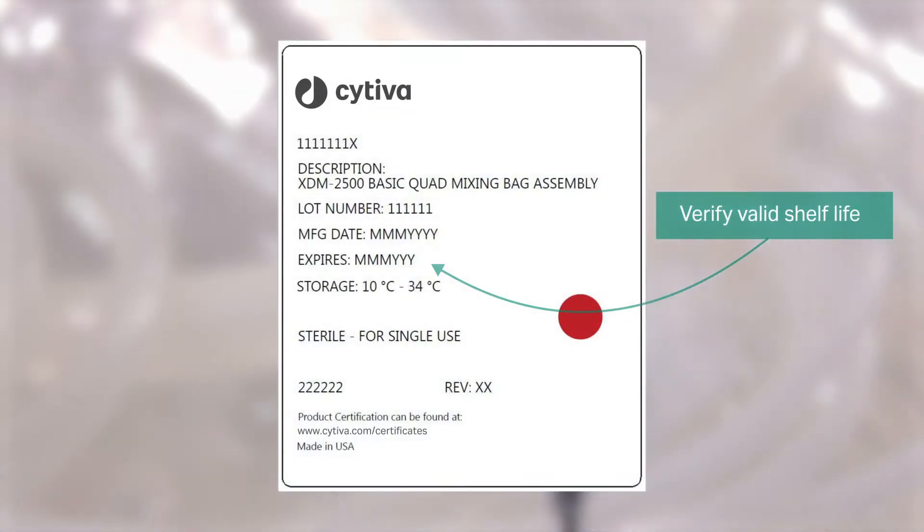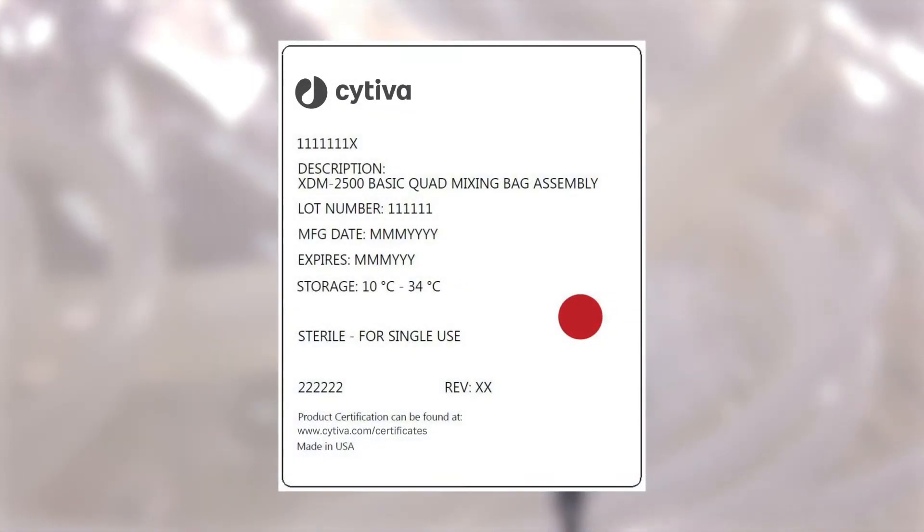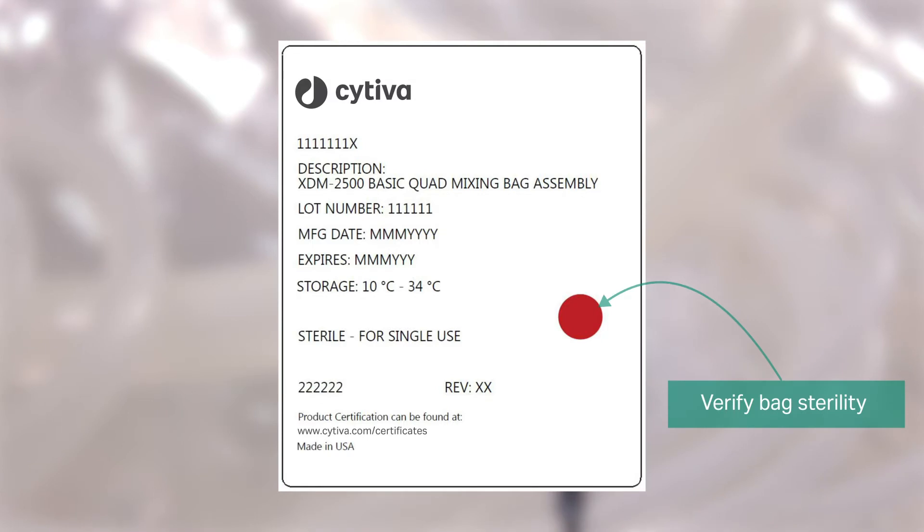Verify that the expiry date has not passed and that the gamma irradiation dot on the bag label is red, indicating successful sterilization.